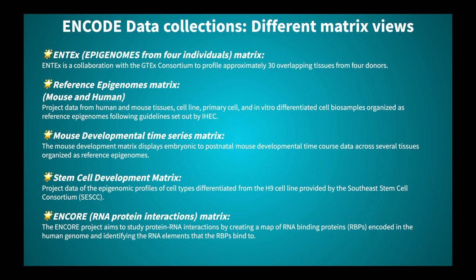In this tutorial, we will be exploring the different matrices that we have arranged in terms of the different collections. Here I have listed all the types that we will be exploring. The first one is the ENTEx matrix.